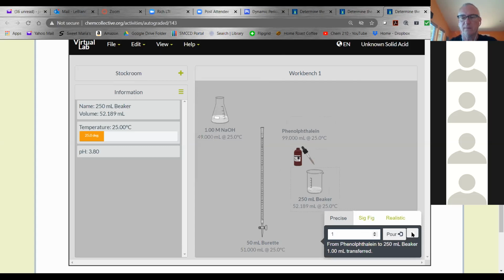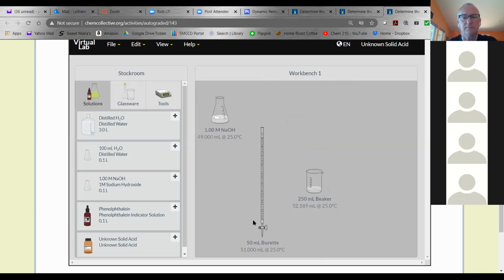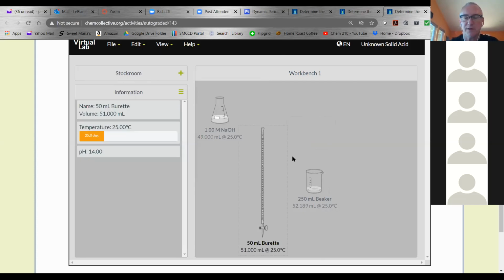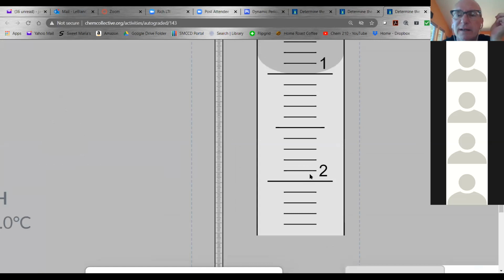All right. So for sodium hydroxide, you put 51 milliliters or 50 milliliters? Put whatever you want. I just decided I'd put 51 and see if it went to 1 mil rather than 2. Let's see. Pretty sure it probably did. All right, let's drag it over. Yep, it's right on 1 this time. So I think if you put in 52, it'll be right on 0. I was just curious. So yeah, I would put down my V1 and zoom in to see what it is. And it is, yeah, it's 1.00, I would say.